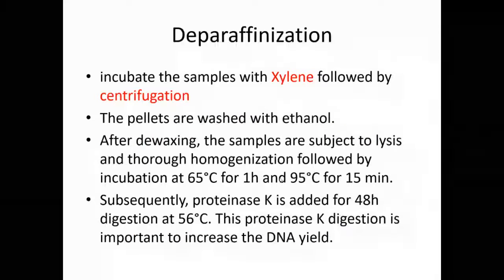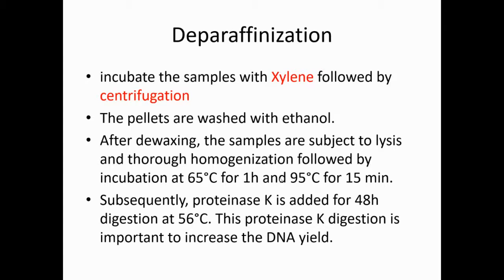And then to retrieve the DNA, the first step is deparaffinization, to remove the paraffin, and for deparaffinization you use xylene. Okay, and then washing in a descending series of ethanol, and then protein digestion, and then DNA purification.